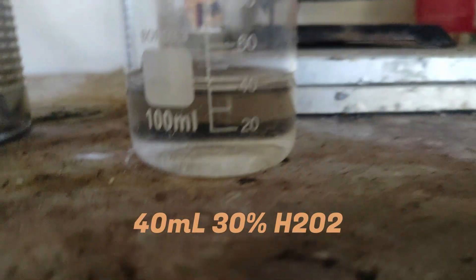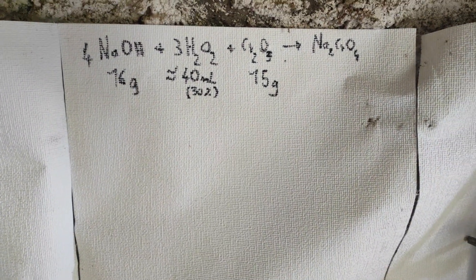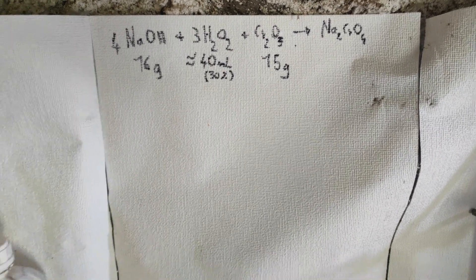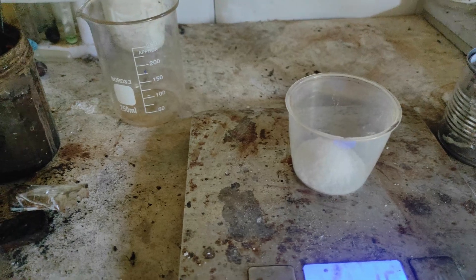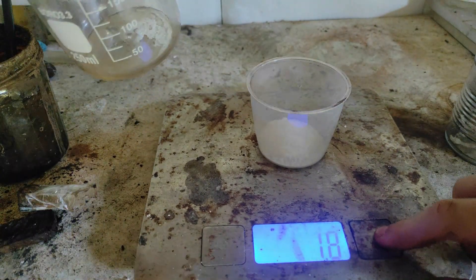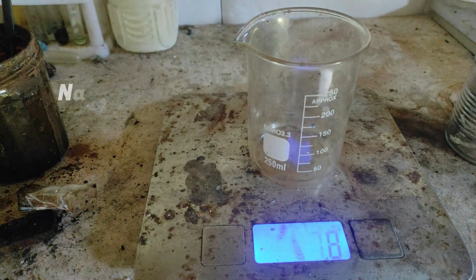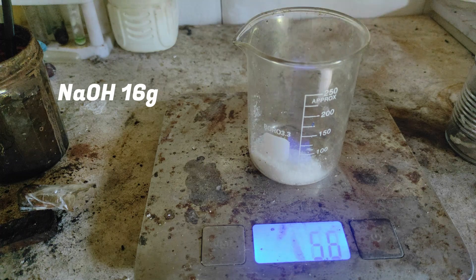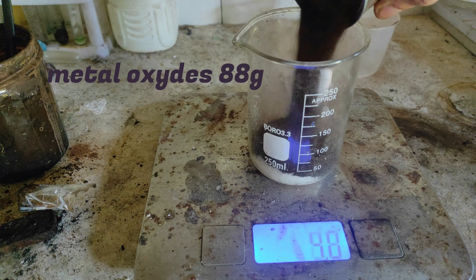Then we prepare some sodium hydroxide and a solution of hydrogen peroxide corresponding to how much we need. However, we will use more hydrogen peroxide than theoretically needed because it gets partially decomposed by the metal oxides. You can use potassium hydroxide instead to make the corresponding potassium salts, but you will have to fix the stoichiometry then.